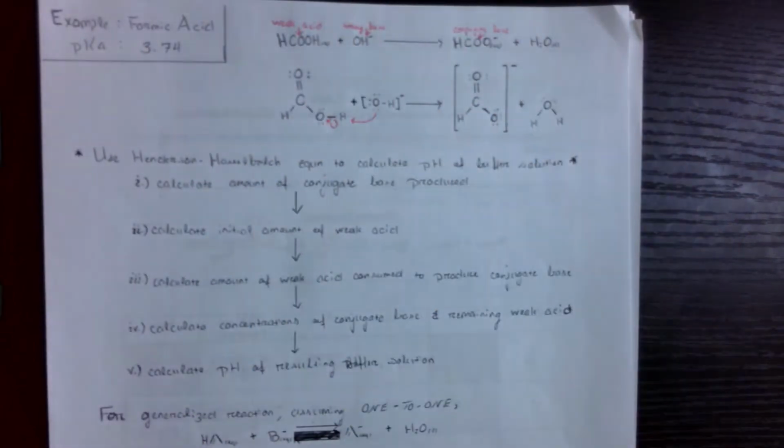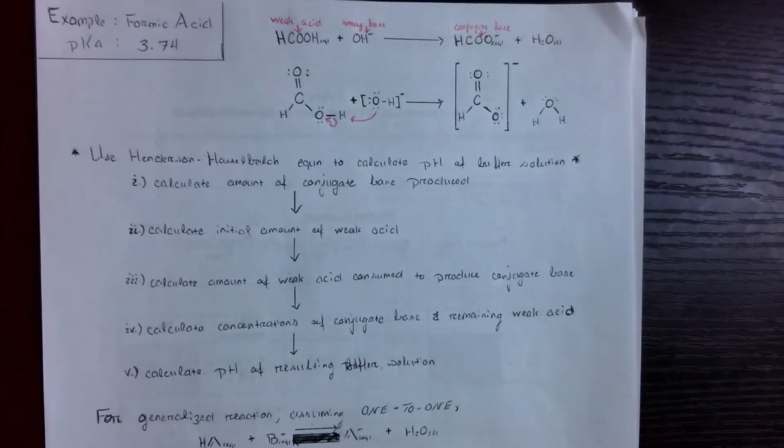And that's sheet 1 of the data sheet, because there are going to be 2 sheets. Sheet 1 deals with the initial pH calculations that I'm going to go through. Sheet 2, analysis, deals with how the pH changes once you've prepared the buffer solution and you're titrating it with a strong acid. So sometimes it's easy to get confused.